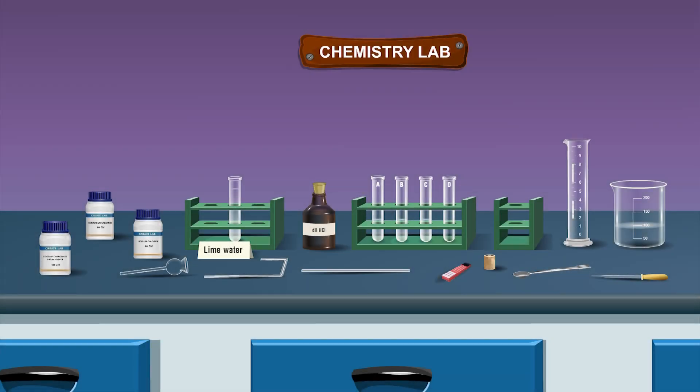Now add one milliliter of dilute hydrochloric acid in each test tube and observe if any effervescence may be formed in any test tube or not.